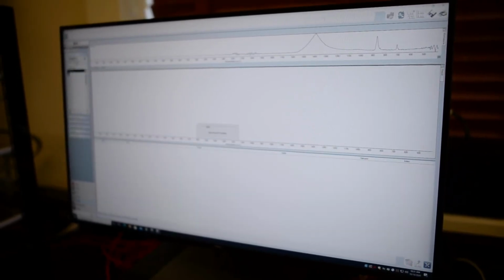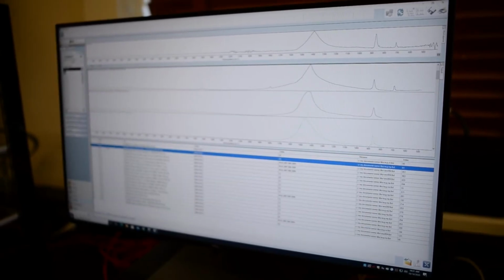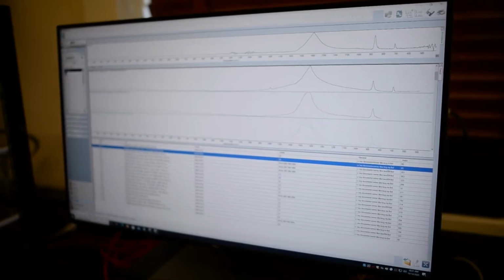And it doesn't really take long to do this. As you can see, it's already done. It's going to pop up matches. And so if we look on the list, our actual first match is calcium carbonate, which we know is in limestone. So it has identified one of the components in limestone. So you can see this is very helpful in helping us identify what groups are in the materials and the chemicals and the substrates that we're using, so that we're able to identify whether, again, like I said, there's contaminants, or maybe like for my project, herbicide residues left behind. Or if we have an unknown material, we can also try to identify it this way.